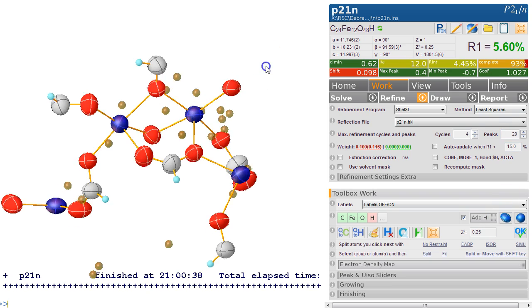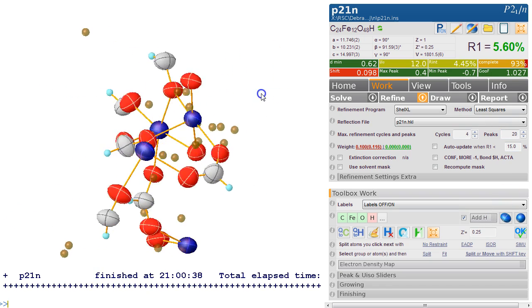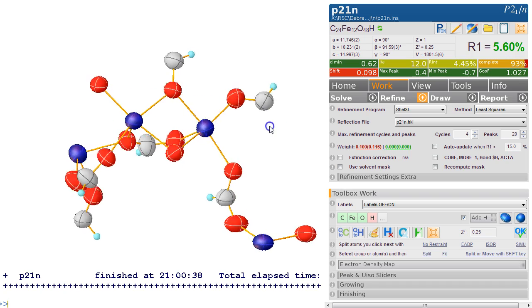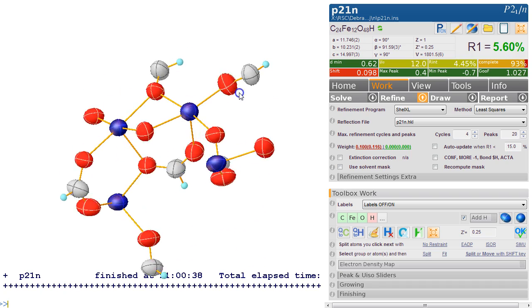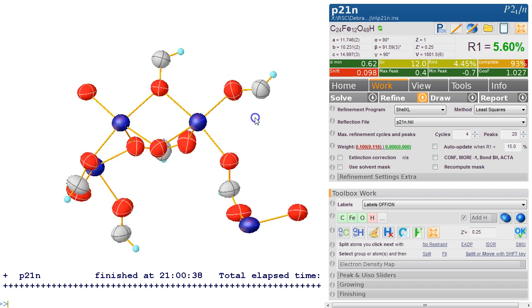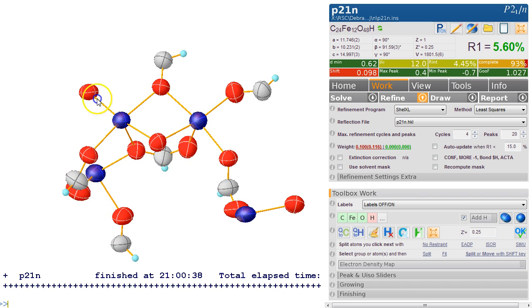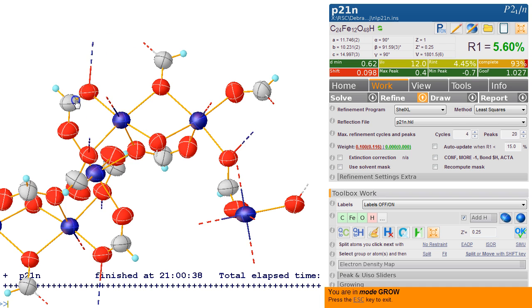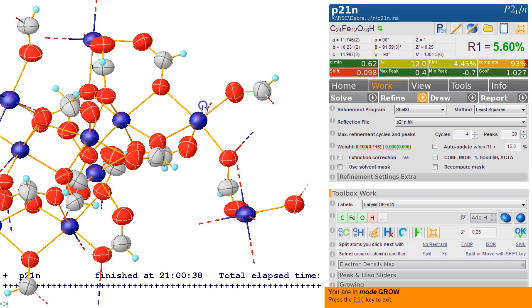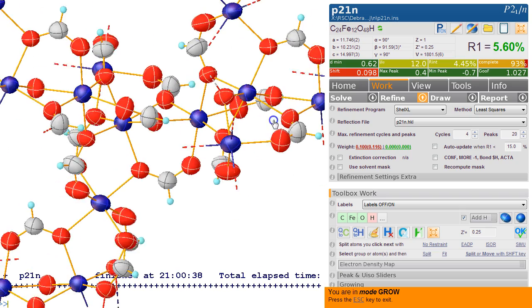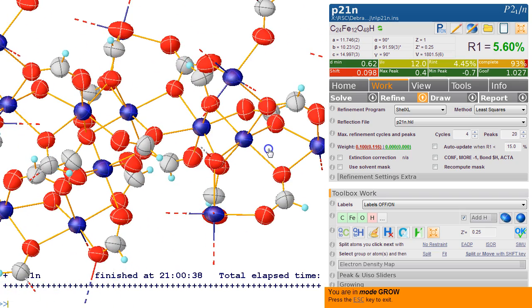and see what we get. So this thing is more or less done. What we now can do—if this oxygen sits here, but if we press Ctrl+G we will see this grow. So if we keep growing on these bonds, this is like a polymeric network and it keeps going and keeps going.